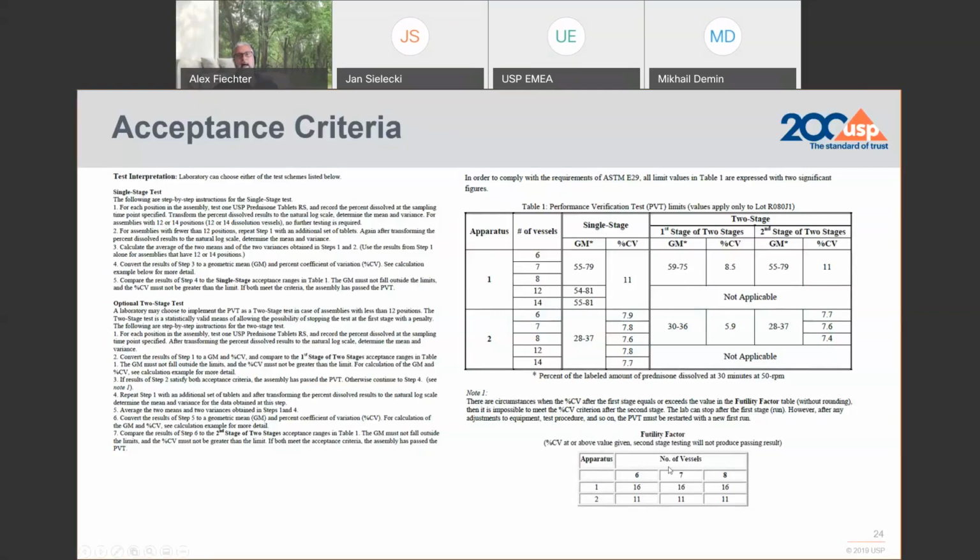Down here, you have a futility factor test that can be applied actually to both single stage and optional 2-stage tests. If you receive results, from a 6, 7, or 8 position vessel, a percentage CV that is 16 or higher, for the paddle 11 or higher, then you can immediately stop the test, because with the second run, you will not come into the specification.